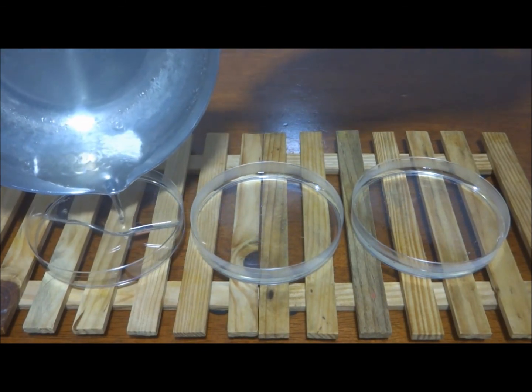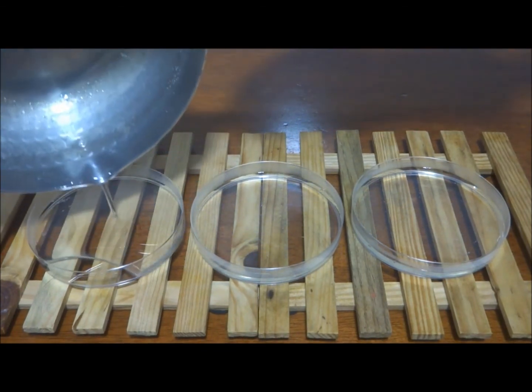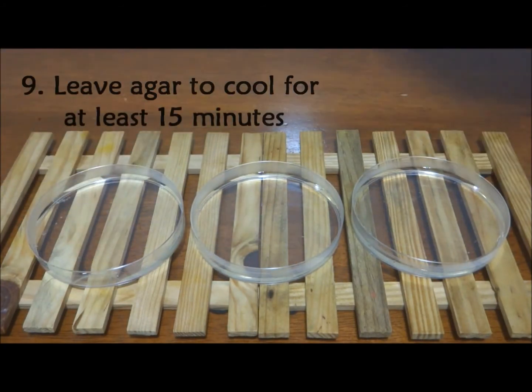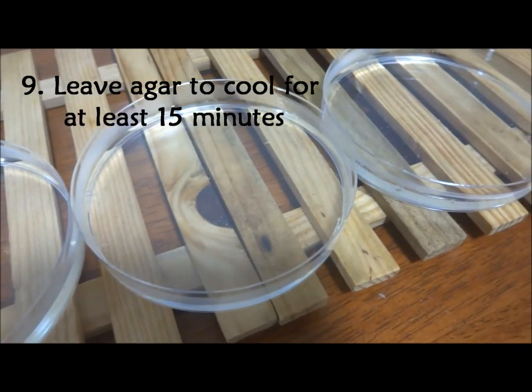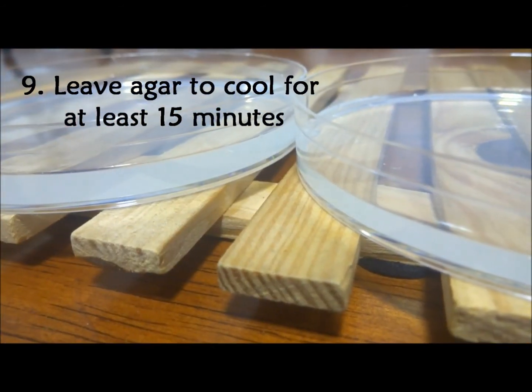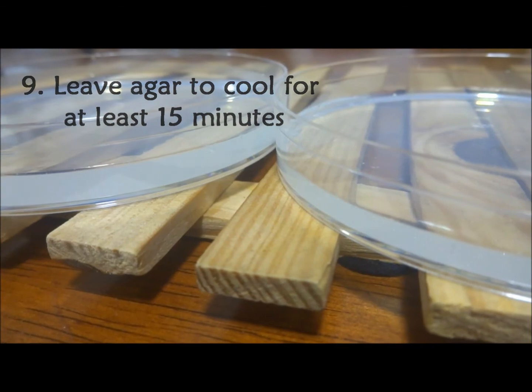Do not replace the lid of the petri dish. Leave the agar to cool for at least 15 minutes. Do not tilt or shake the plate when the agar is cooling, as this will affect the consistency of the agar.